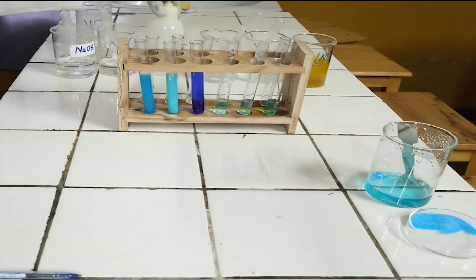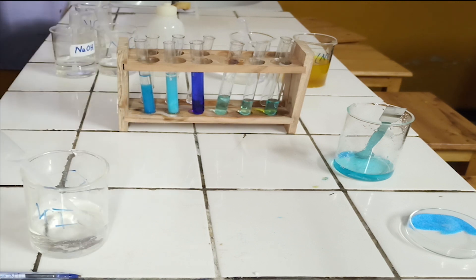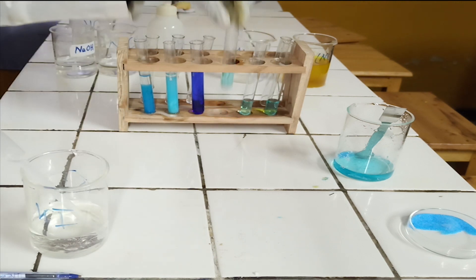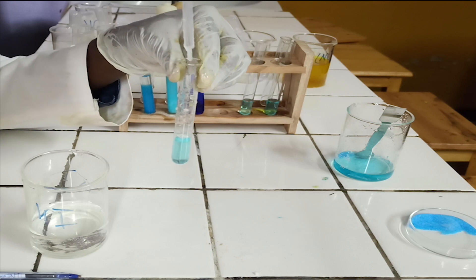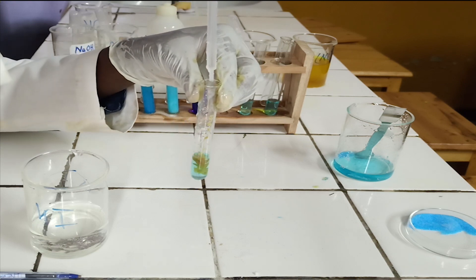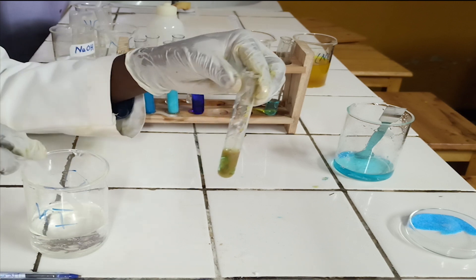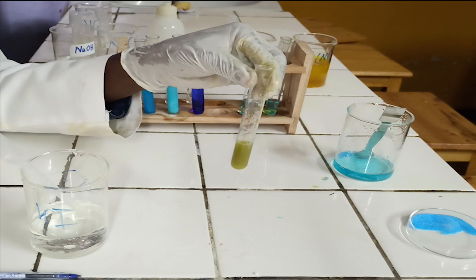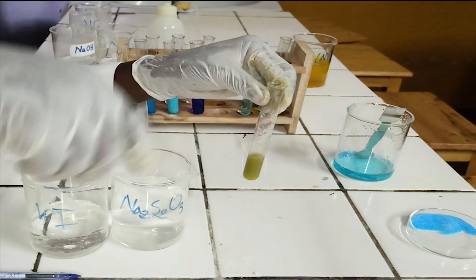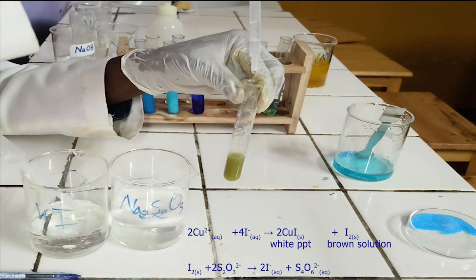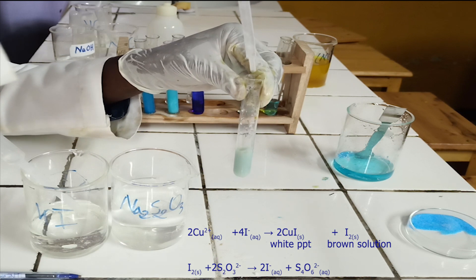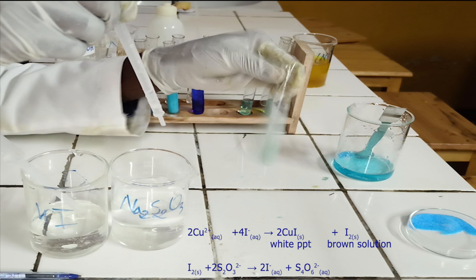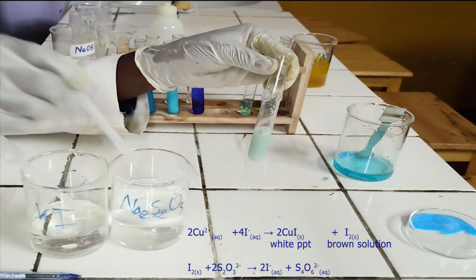Second confirmatory test. To the fourth test tube, add a few drops of potassium iodide solution followed by sodium thiosulfate. As you see, potassium iodide reacts with copper-2-ion to form a white precipitate and iodine, which appears as a brown solution. Iodine produced reacts with sodium thiosulfate, then the brown color of iodine is removed. A white precipitate of copper-1-iodide remains in the test tube. Below, there is the ionic equation for this reaction.